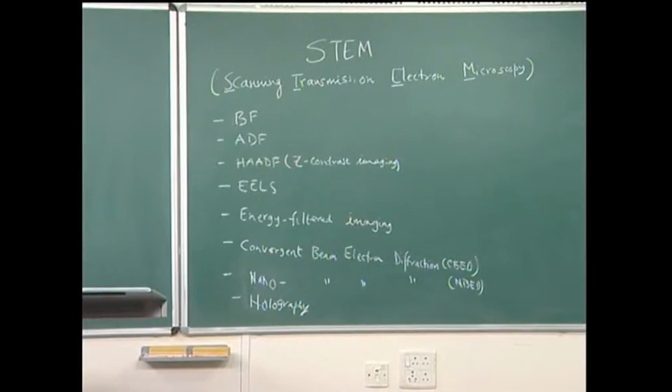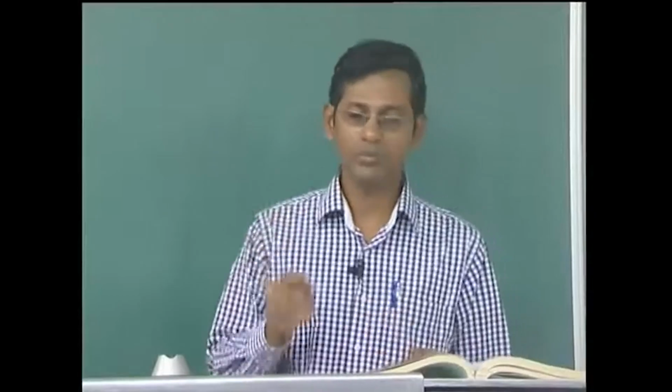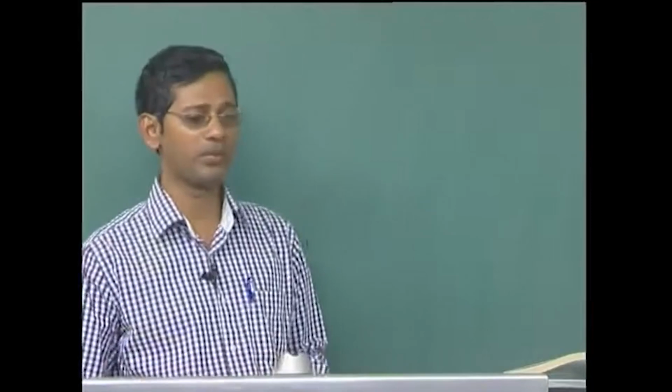So, with this I close the high-resolution electron microscopy portion of this course, and I move on to the next portion of this course, that is called STEM, Scanning Transmission Electron Microscopy. As you know, scanning transmission electron microscopy has become an integral part of the microscope nowadays. All the modern day microscopes have a scanning transmission electron microscopy facility. This has originated from work by Crewe and many others, who have tried very hard to use scanning transmission electron microscopy.